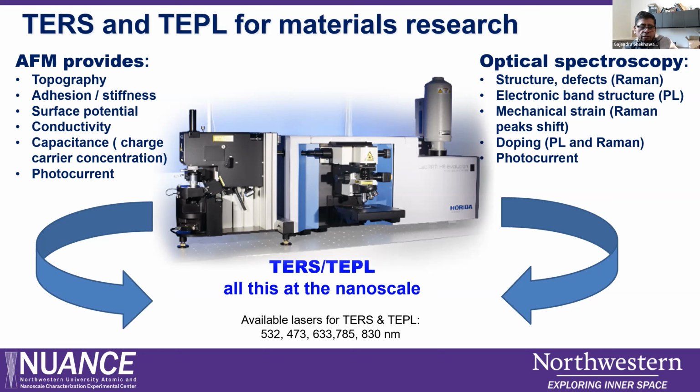Then we have an environmental chamber here, so you can have a different environment, different gases, and also a heating and cooling stage. So basically, you can do it at different temperatures. You can do liquids. Then we have a high-end Labram AFM integration here with such laser configurations.